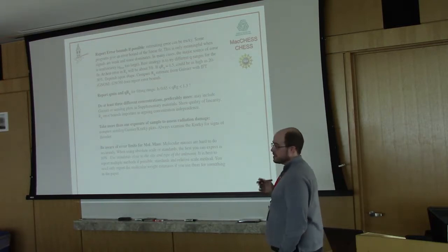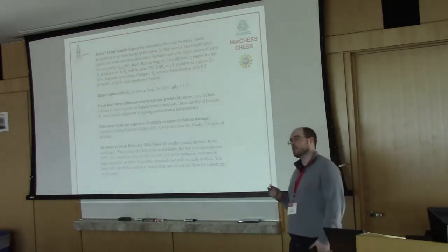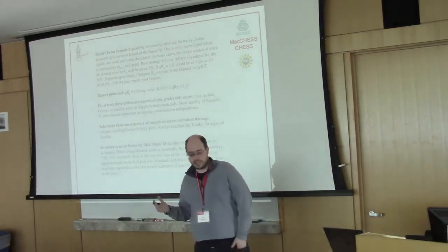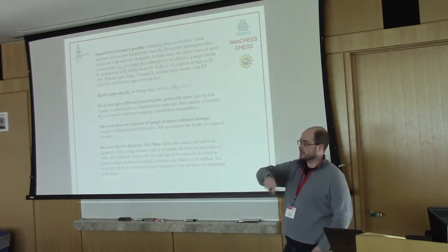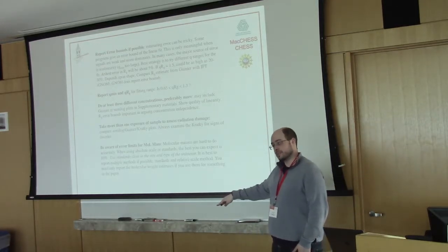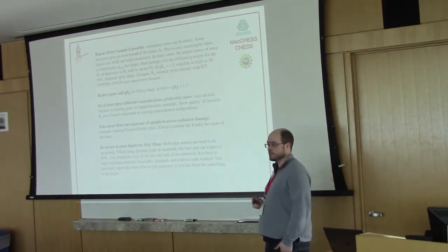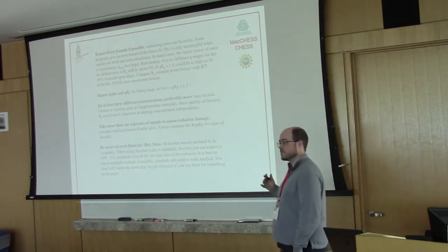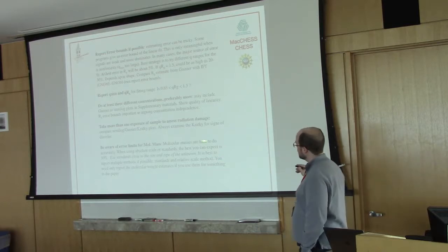As Richard mentioned, for standard experiments, you need to do at least 3 concentrations if you're running in batch mode or robotic mode, as we call it here. Otherwise, you may have concentration effects that are hiding. For SEC-SAXS, you don't need to do this because you're sampling over the entire elution peak, so you're already sampling a range of concentrations. So that's built into that experiment. And Steve will talk about that momentarily. But for a standard experiment, you need multiple different concentrations so you can make sure that it's not changing with concentration. And that's very critical.